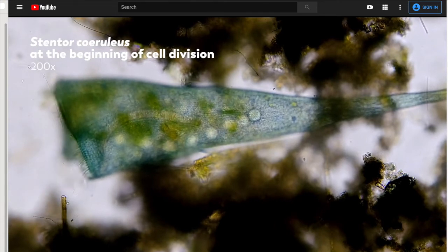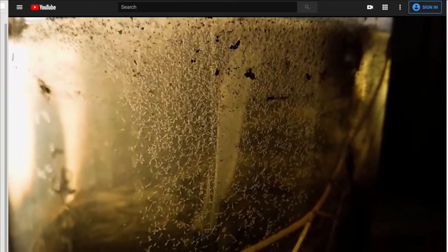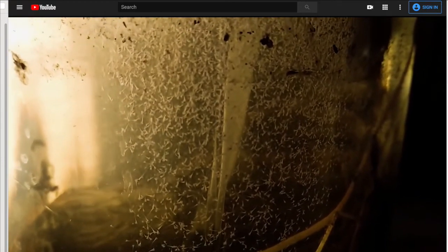Surprisingly, they thrive even when it's freezing cold. We have a stentor culture set from Stentor caeruleus collected under 20 centimeters of ice. Possibly the lack of predators during the winter keeps their numbers extra high.